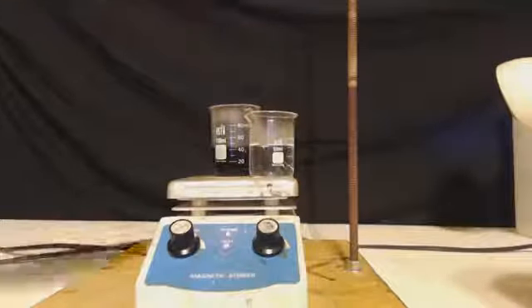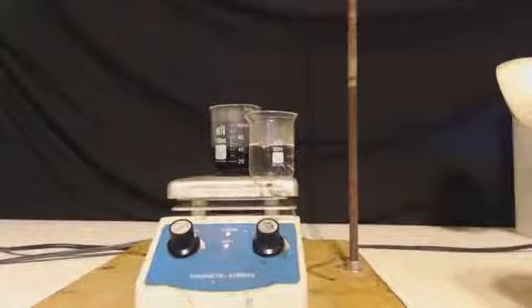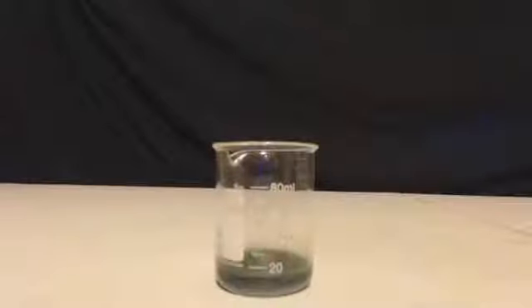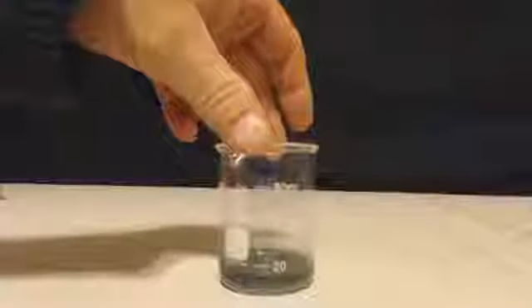Now, I did this, and it stunk up the room. Heated up chromium is terrible. So I stopped it. But what I usually do, because I have made this before, is at this point, I just put it out onto a plate and let it evaporate naturally. The slower it evaporates, the more pure your stuff is, so you can't lose. But it does take several weeks.